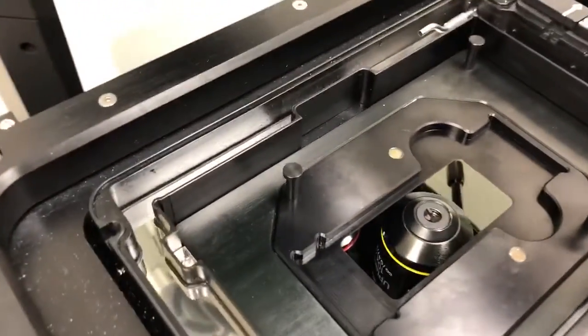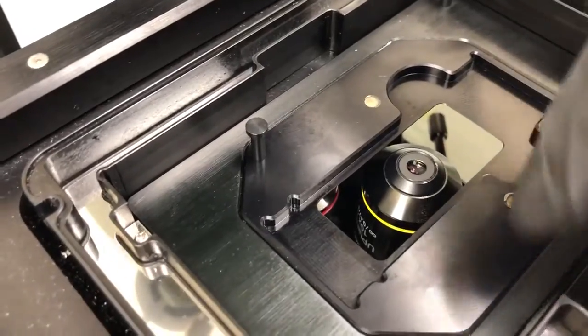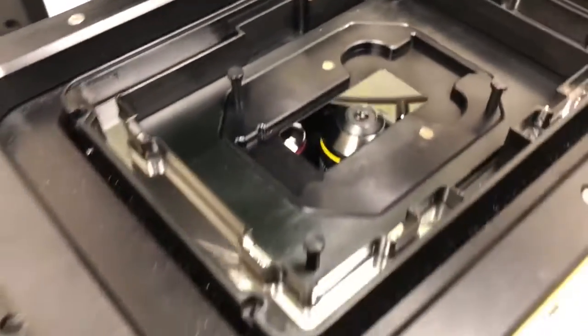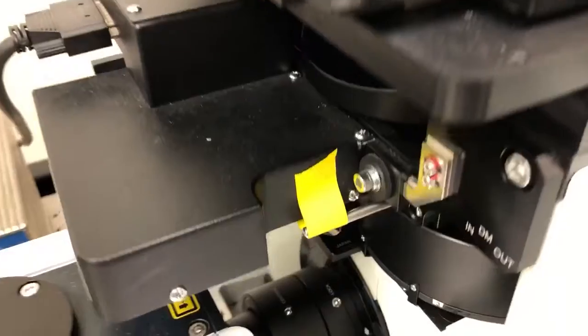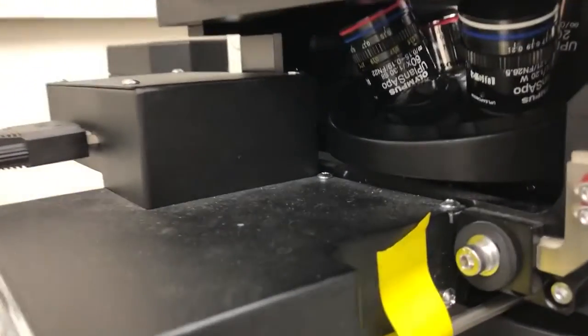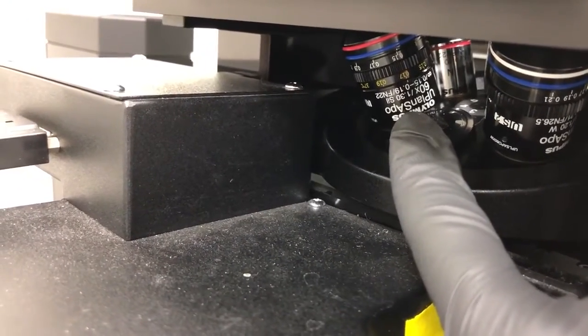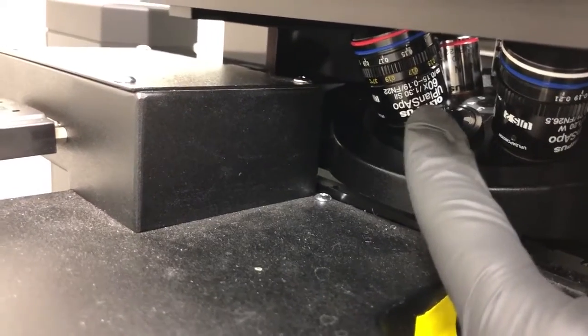By default, the microscope starts with the 10x in the sample position—that's the objective with the yellow ring, so that's what's in position now. Let's see if you can visualize the 60x silicon objective. The 60x silicon objective is this one right here, and what we need to look at are the markings on the side.